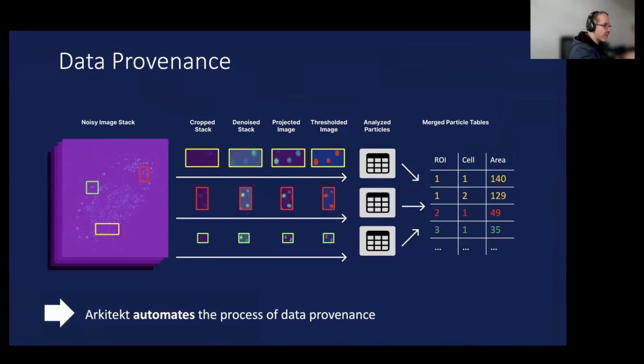You can put a set of data saying, I have this result or set of data, try to reproduce it. Yep, exactly. Okay. The workflows themselves, like there's runs, which is like what you did, and workflows are also like the recipe. They can also be shared. You can export them and load them into another computer. And the nice part is that they're a bit agnostic. So you don't have to have the same ImageJ version as the other person, right?